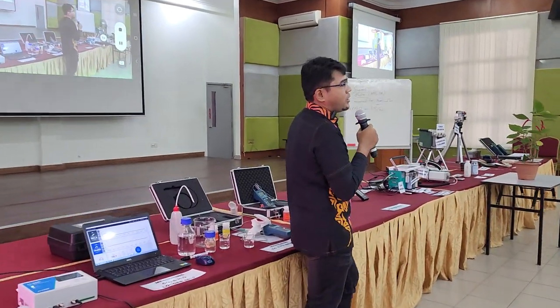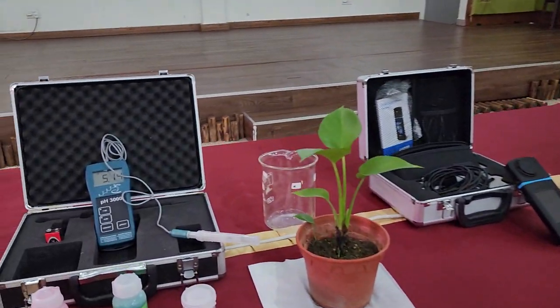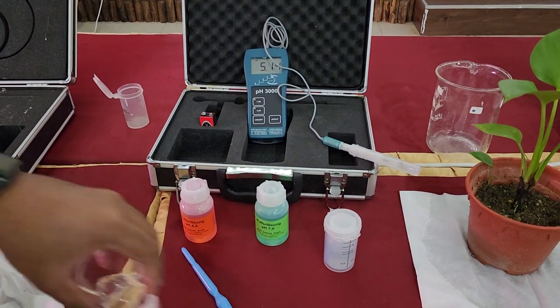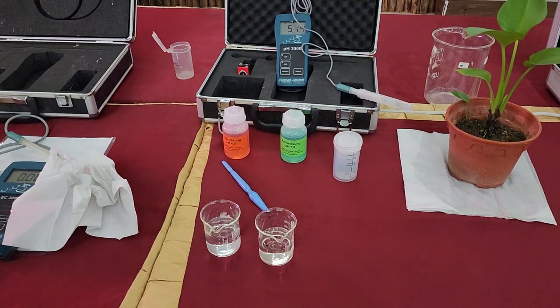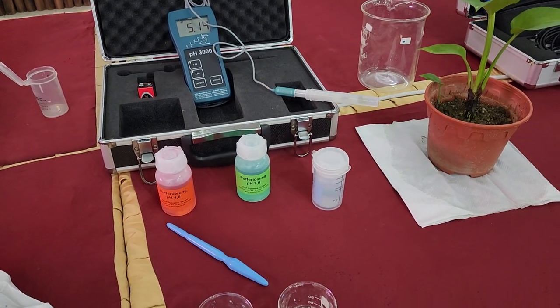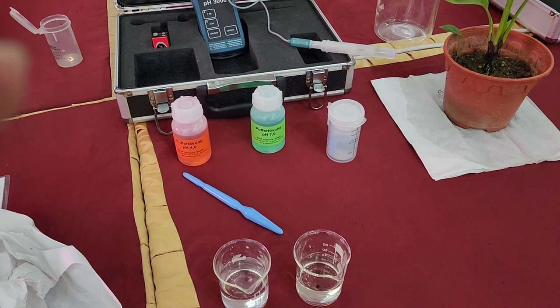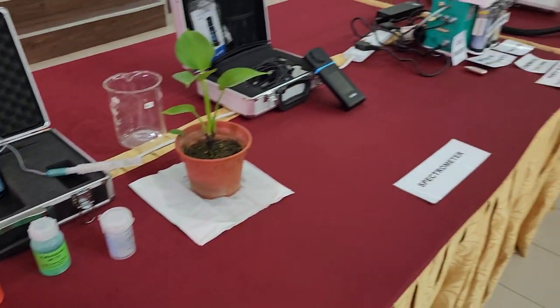Alright, okay. Second equipment, the pH. We can use the same solution. What is pH? Anybody want to tell the class what is pH? Hydrogen. What about hydrogen?